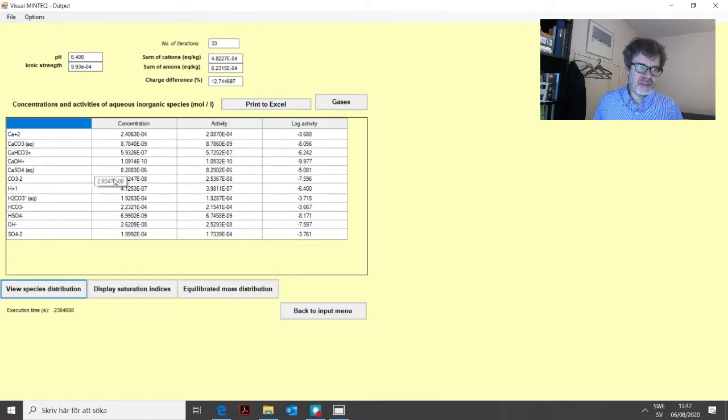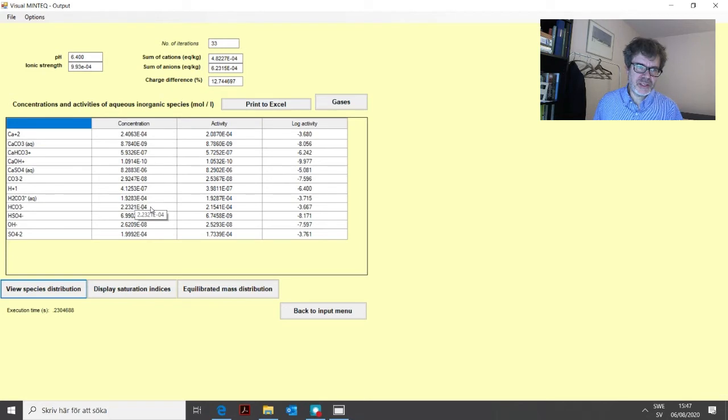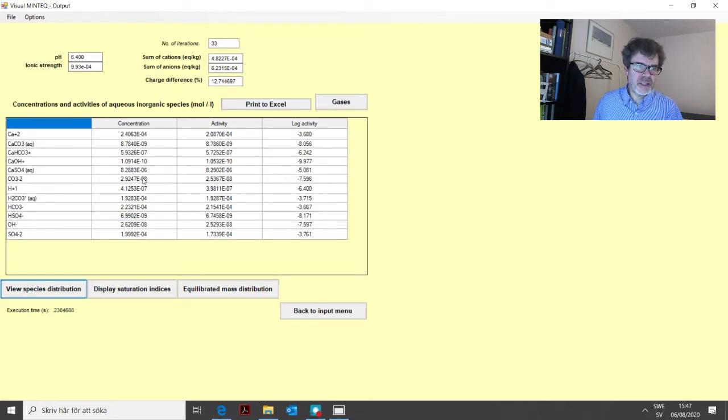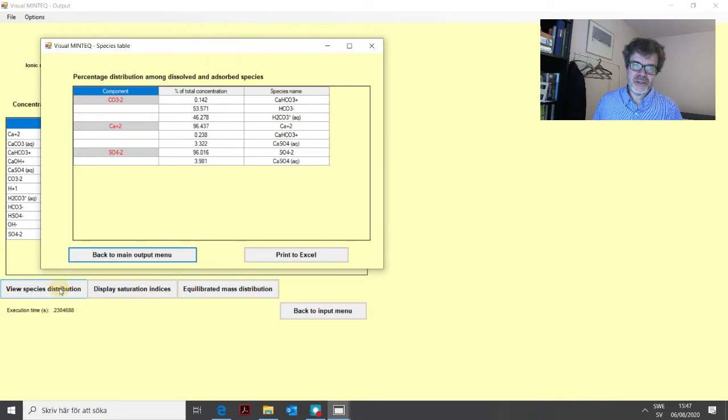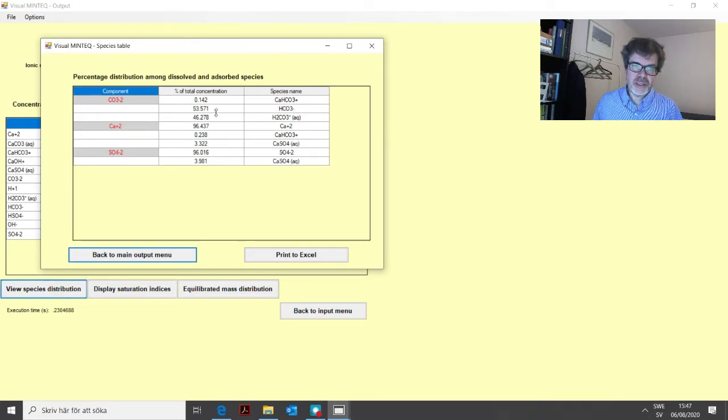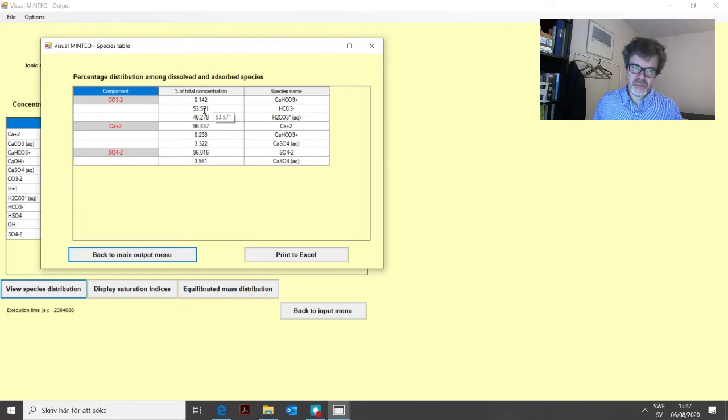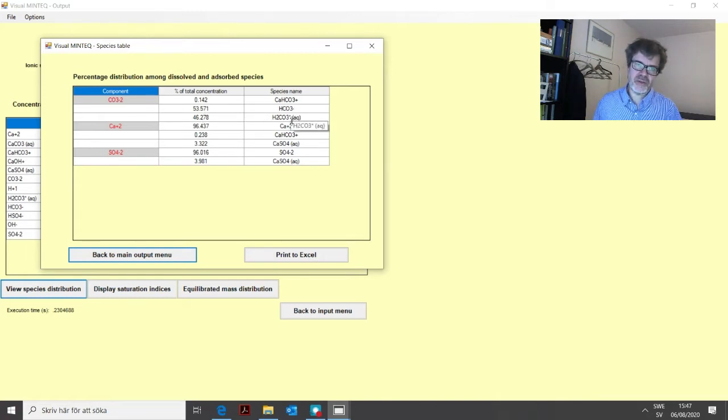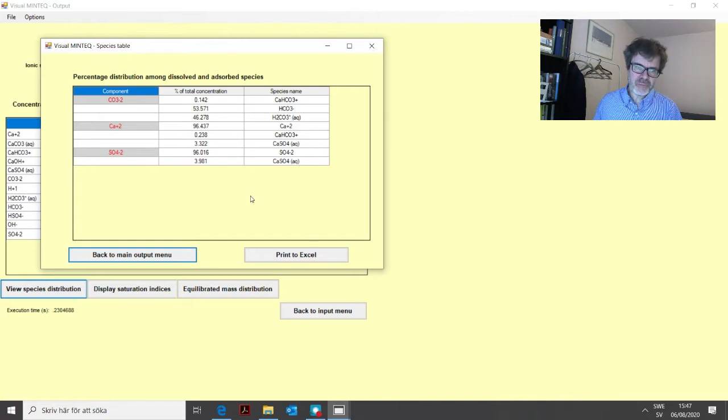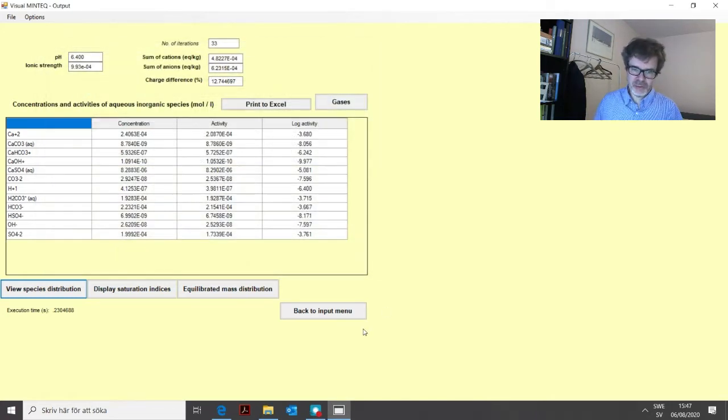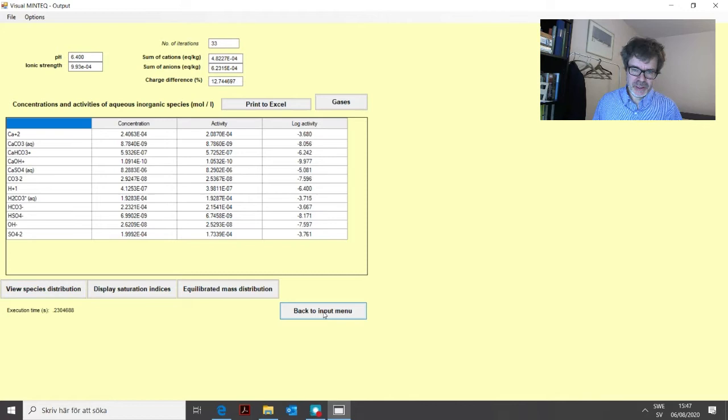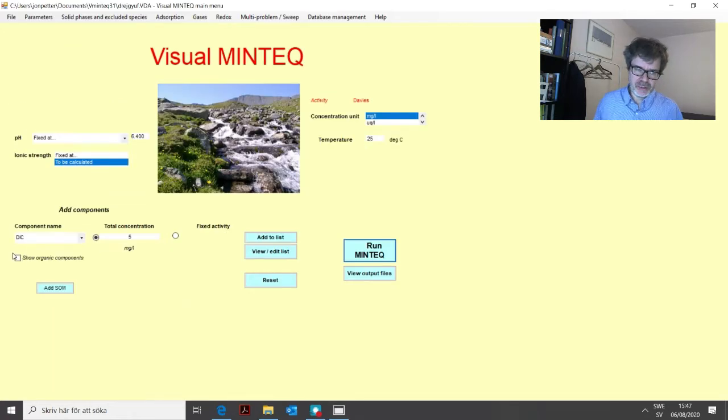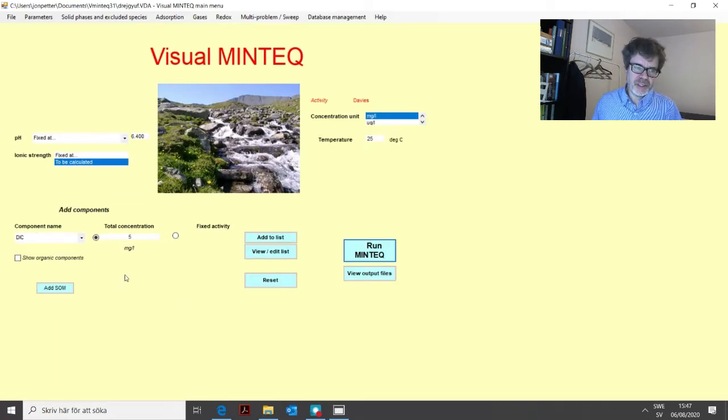We have both bicarbonate, as you can see here, and carbonate. And if we click on view species distribution, you see that of our DIC, about 53 percent was present as bicarbonate and 46 percent as carbonic acid. This is one common way of actually giving or analyzing carbonate in a water sample.